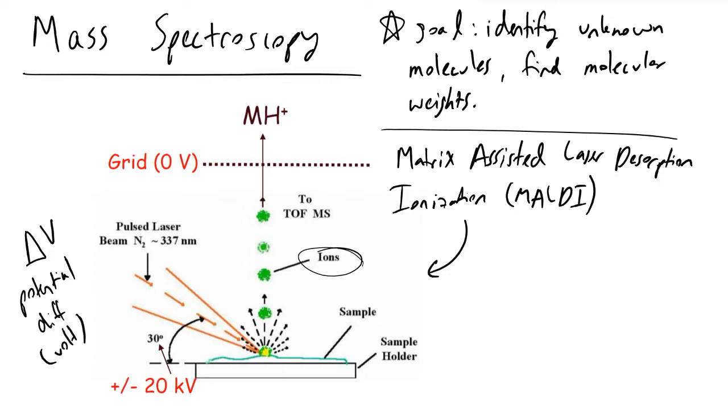The potential difference will cause anything with a charge to have a force applied to it in this electric field.